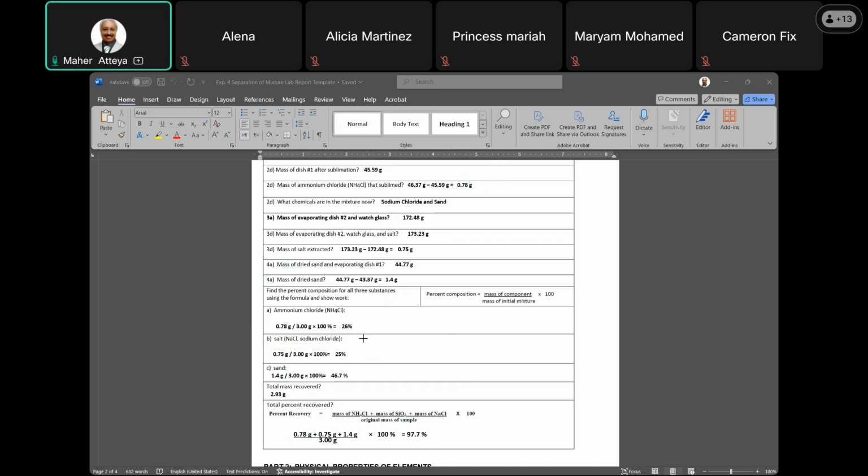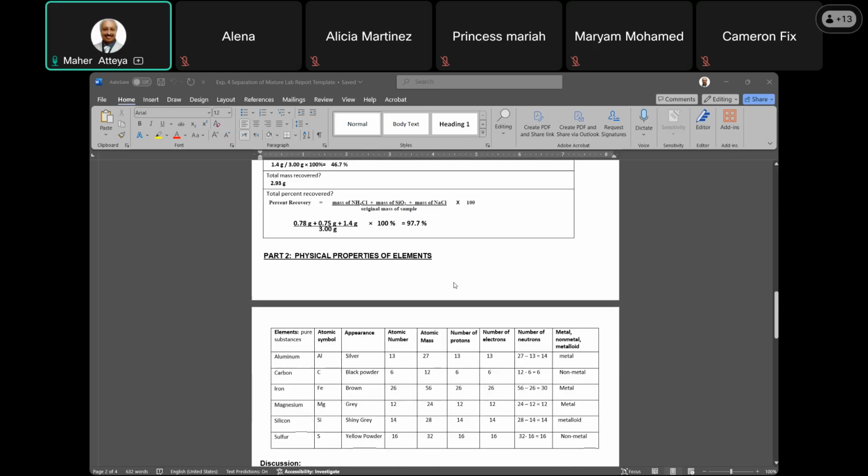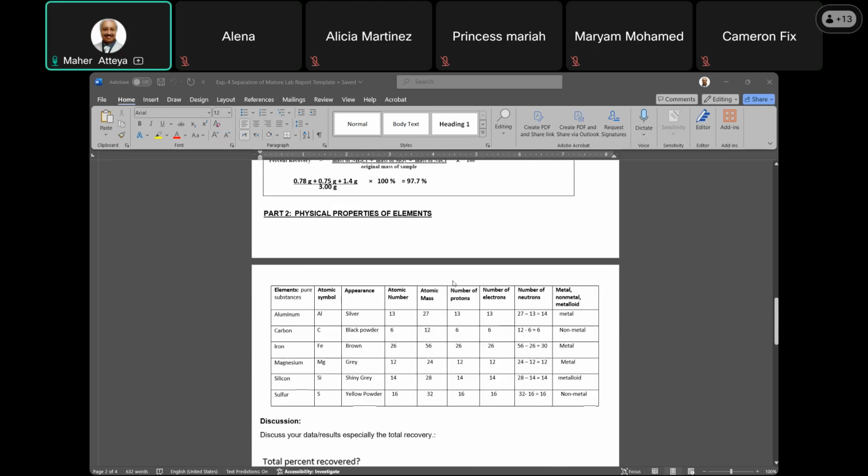So now this is part 1. We did part 1. Any question about part 1 of the experiment, please? Everybody's following me? Yes, yes, yes. Okay, good. Now part two. Part two, you get vials.